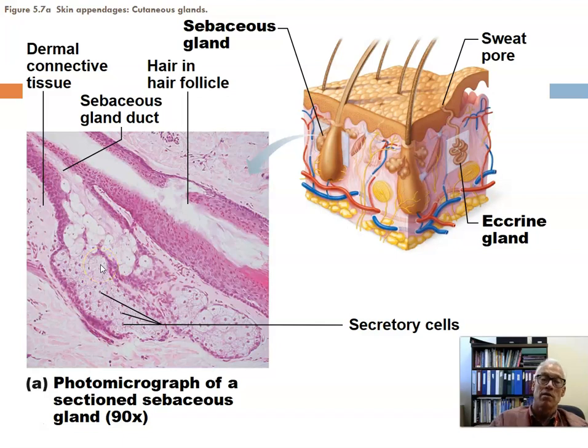Associated with the hair follicles is the sebaceous gland. Finally, now to some histology associated with hair, because I would like you to be able to recognize this hair follicle within a micrograph of skin, and it has a very characteristic look.